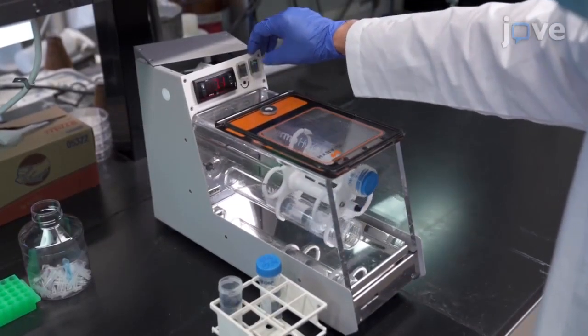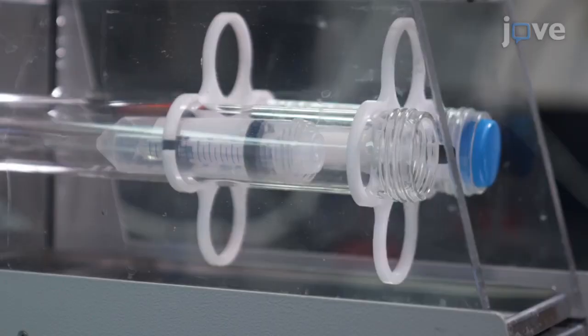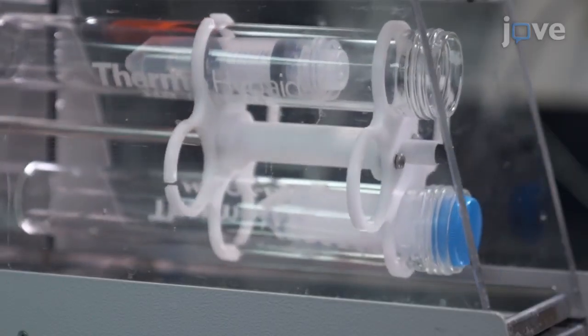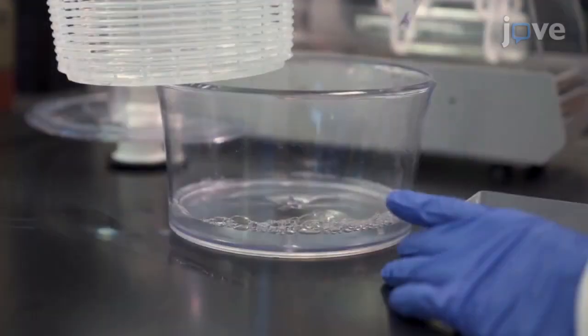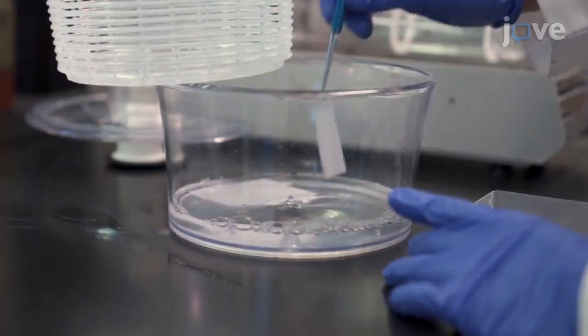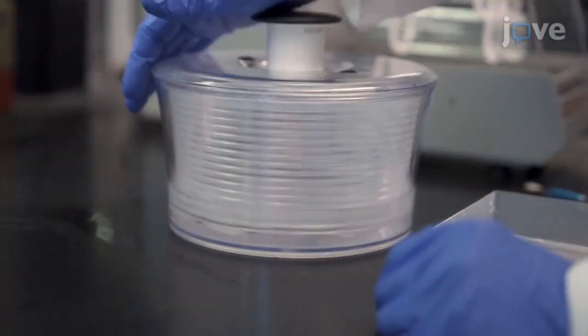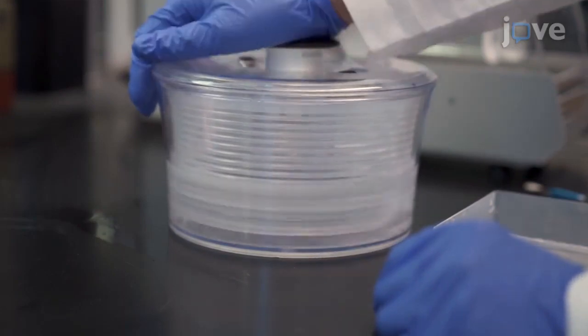Because Western blotting is common to many different research areas, it has broad applicability to speed up research. The successful use of this protocol relies on the optimization of antibody dilution with immunoreaction-enhancing reagent and incubation time.